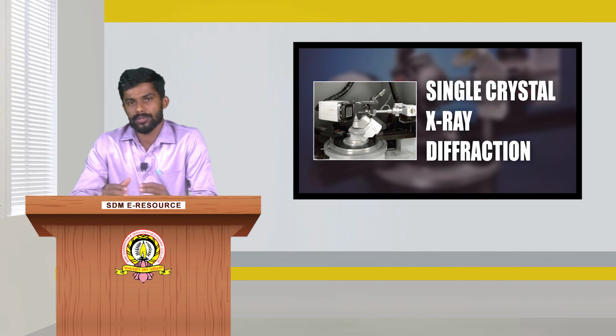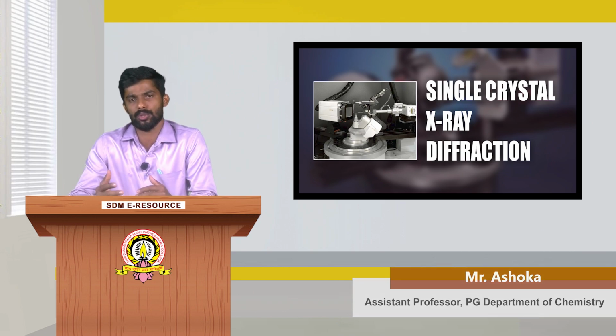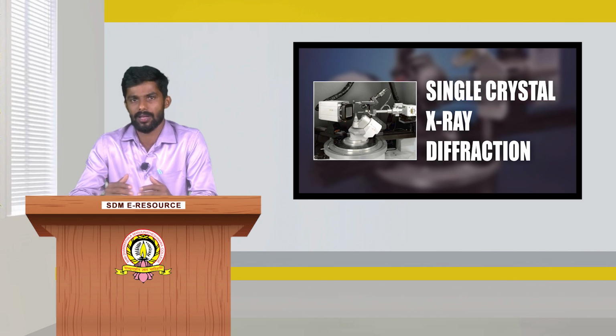One can use it for the determination of crystal structures. So it finds applications similar to PXRD in various fields. Thank you.